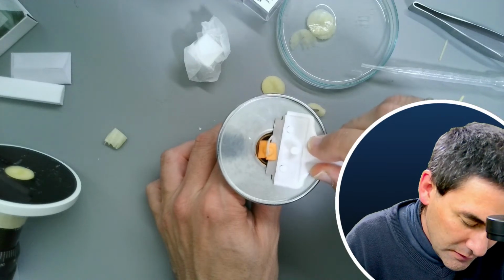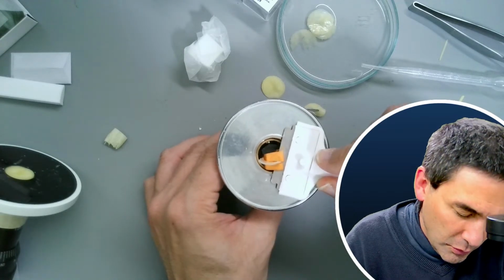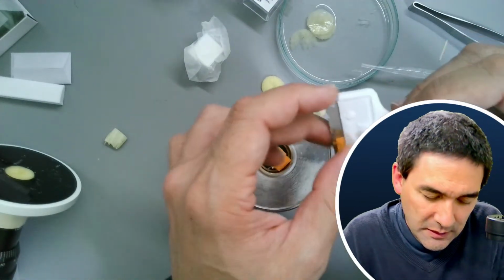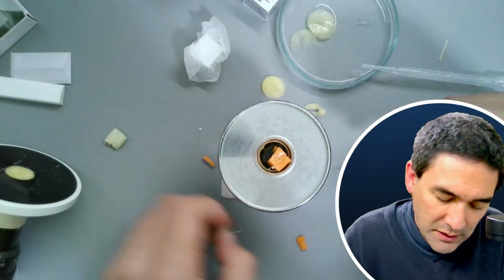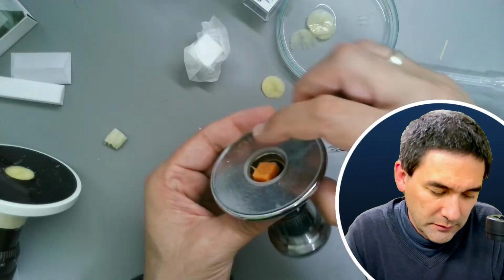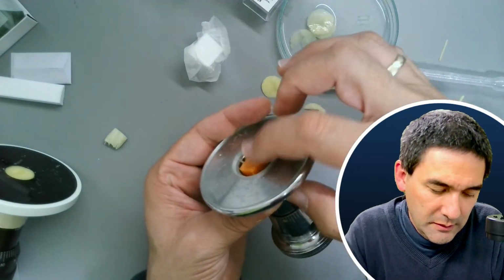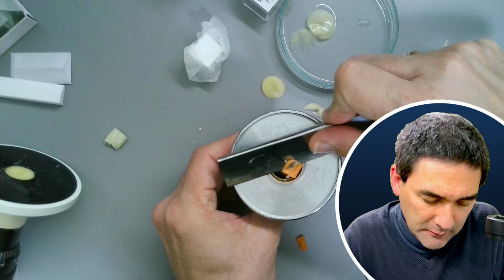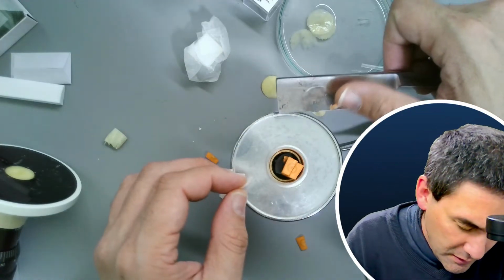So again, you see that is a little bit the issue here, that I'm not able to cut all the way through. And that is indeed a huge disadvantage. So maybe I am indeed going to use this knife over here. It does seem to be a little bit flush. Yeah, it's not completely smooth. So let's try like this. Okay, I do have a slice here, which is still a little bit too thick, I think.